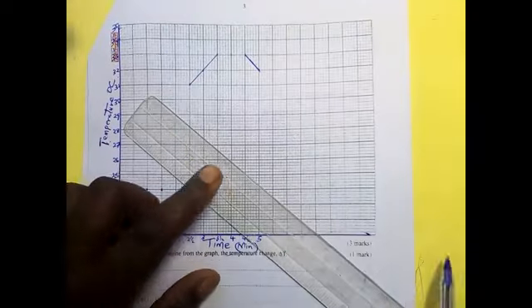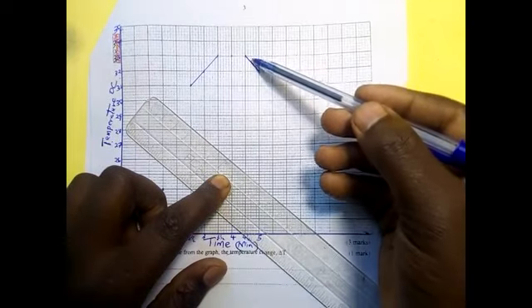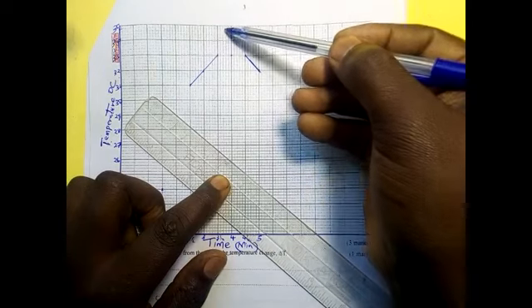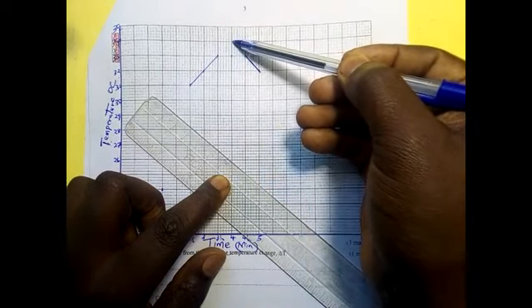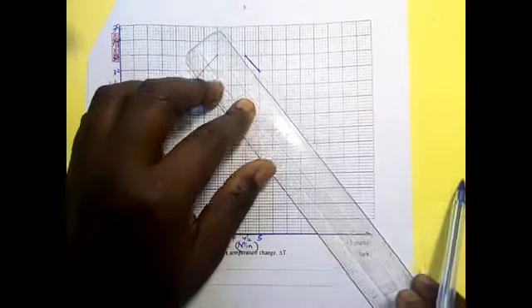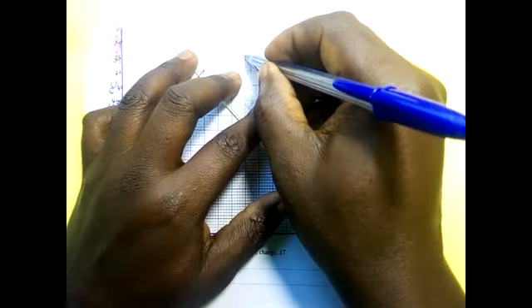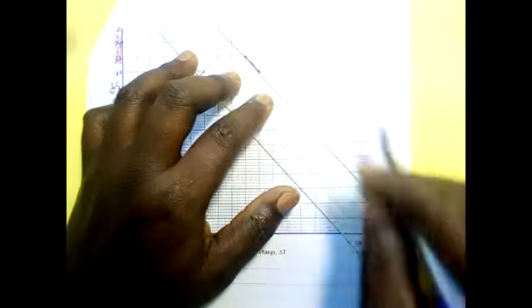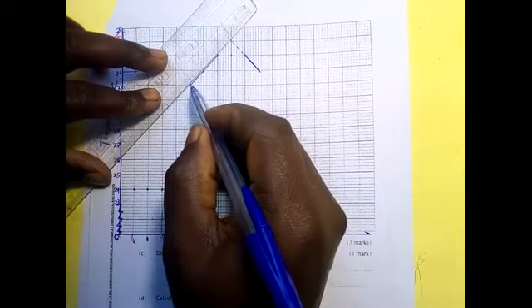So I have plotted these 2 points. This means that after you have this point, you extrapolate this point to this side, extrapolate where the 2 points are going to meet. That will give us the maximum temperature reached. So we extrapolate. You use now a dotted line like this, and then this side, dotted line.